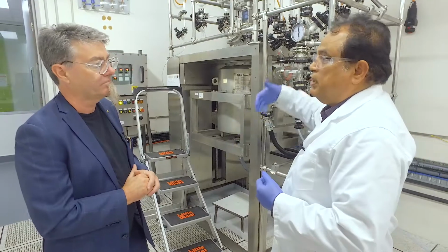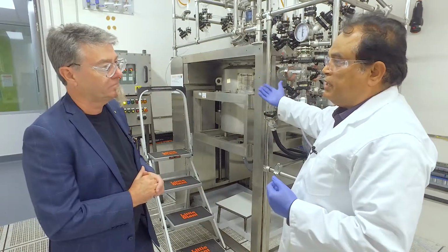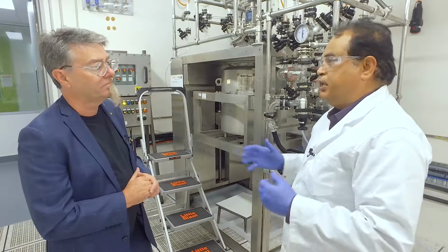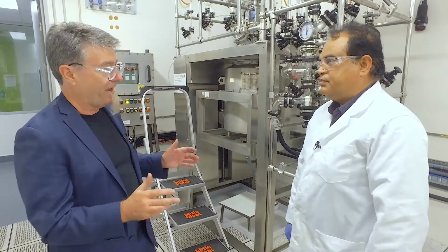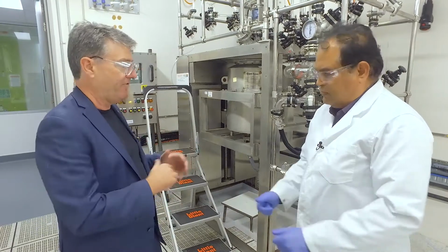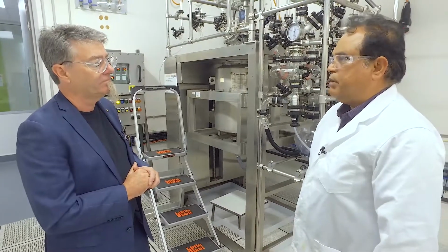We can go to industrial scale, because at this stage we are doing the reactions at 35 liters. And from 35 liters, taking the batch to around 500 liters or 1000 liters is not that difficult once the parameters are optimized. So in meeting the needs of our experimental program in terms of exploring fabrication, we're also making this process ready for industry, ready for manufacturing. You're absolutely right. Once we are confident on that scale, we can definitely go to industrial scale manufacturing.